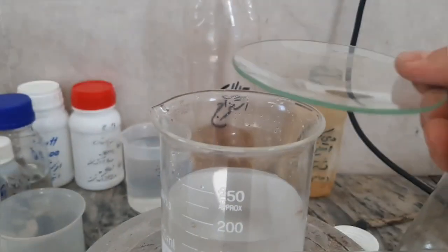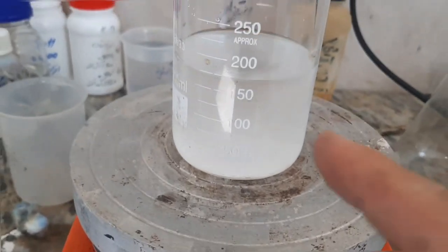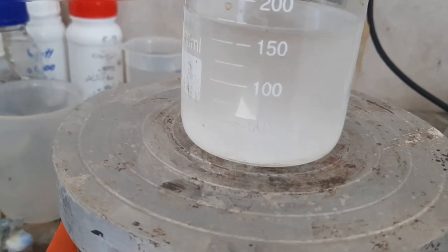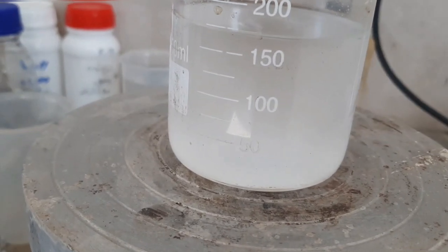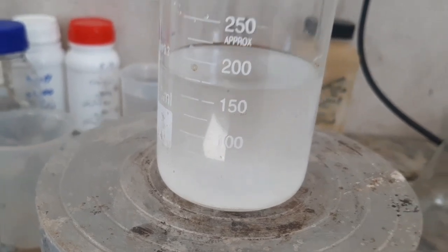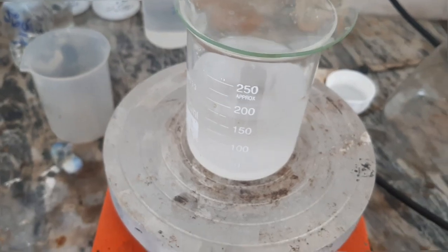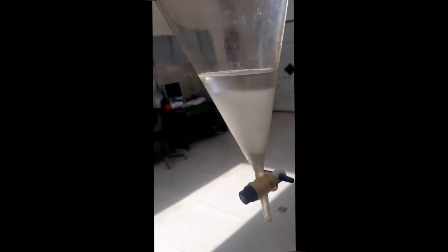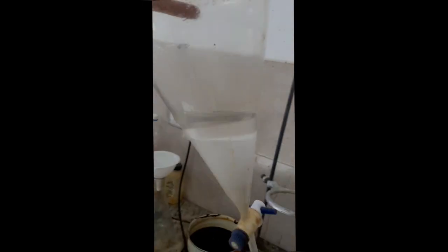So I poured all the mixture into a beaker for a better visualization, and I've put it on a stirrer. It has been mixing for almost an hour. You can see the layers of calcium chloride, ethanol and water separating from our product, and we're going to separate it in a bit. As you can see here, I have added all of it to a separation funnel and I'm waiting for it to separate.